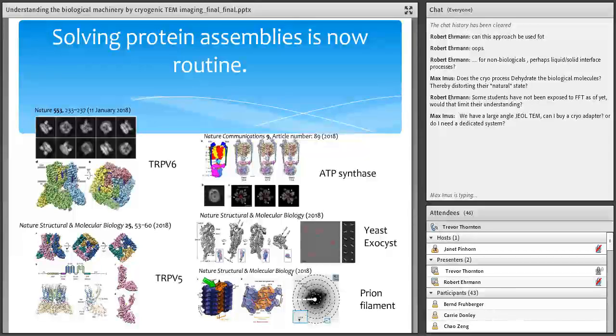Dwight, can you explain why they succeeded in going to 0.7 angstrom? It seems amazing. Well, it's an amazing achievement, really. Because they're looking at electron diffraction, they're able to get to a little bit higher resolution. This was on an aberration-corrected microscope. Yes. Okay. Now I know why Katia was mentioning it. It's amazing. Literally, these are all from the last few weeks, 2018, so I can see why this is all this month, in one journal. So we can begin to understand just how transformative this is going to be.